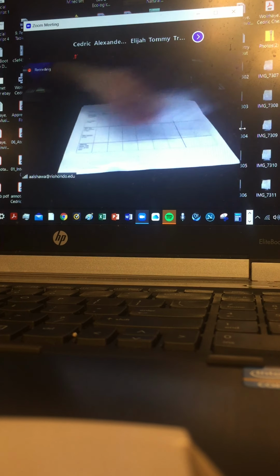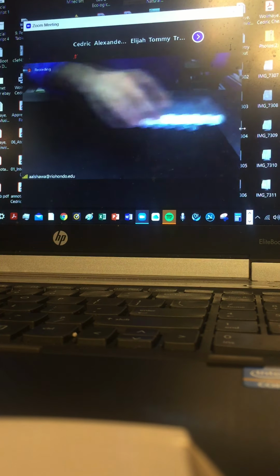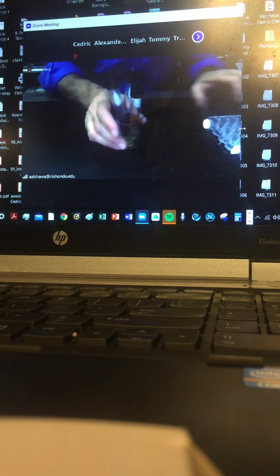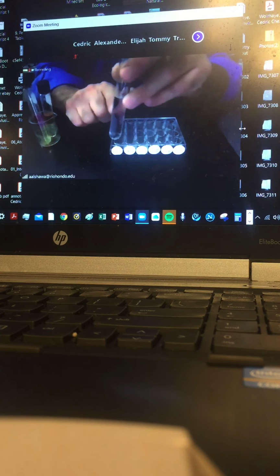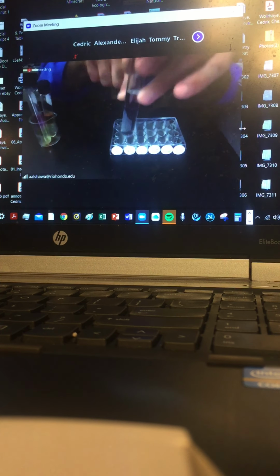So the way it operates is the following. Let's push these on the side for now. Before I start that test, what I have is 3 test tubes. In the first test tube I have chlorine and water. So there's chlorine, Cl2, with water.